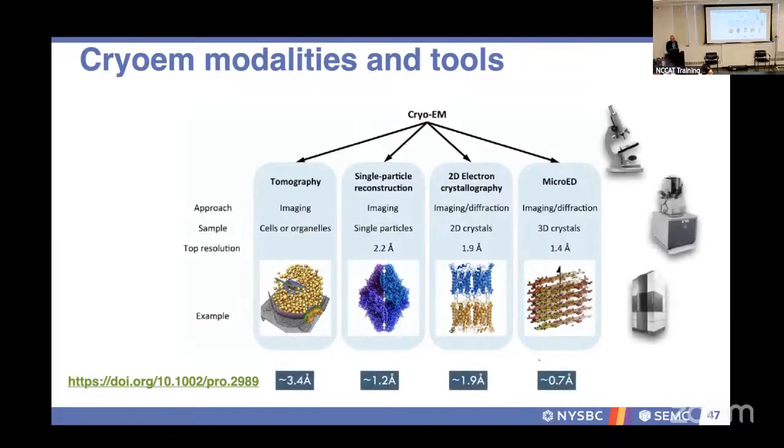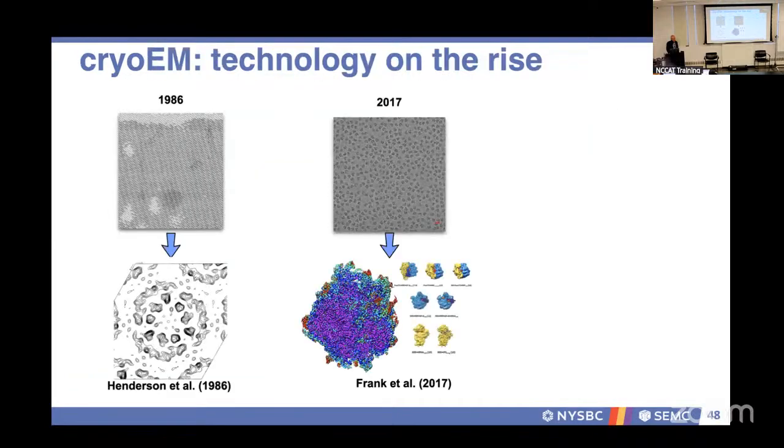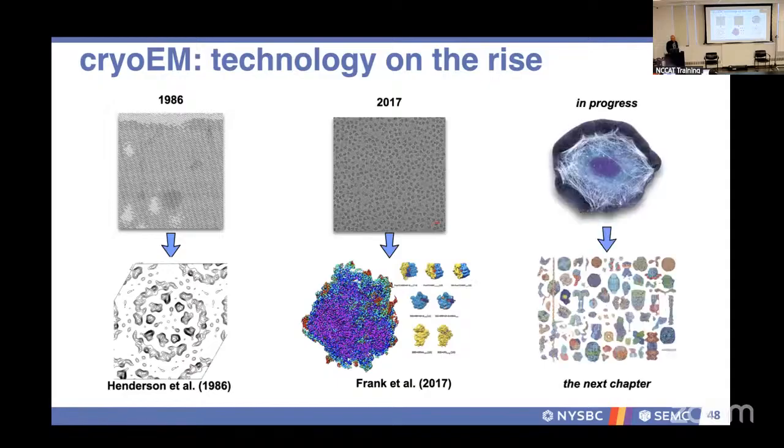But with an electron microscope, we can access several different resolution regimes. I skip other types of microscopes. For example, you will get a vignette of a scanning electron microscope. That is also an electron microscope that's very useful. And with that, we can see how over the decades we've been able to use the electron microscope to interrogate a variety of samples, access a variety of resolution regimes, and be able to glean a lot of biological information. Okay.